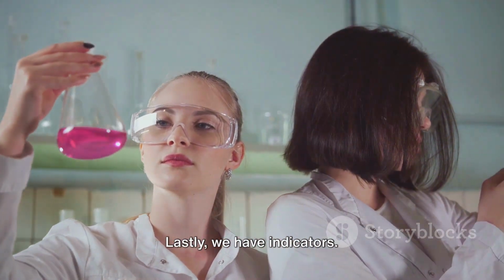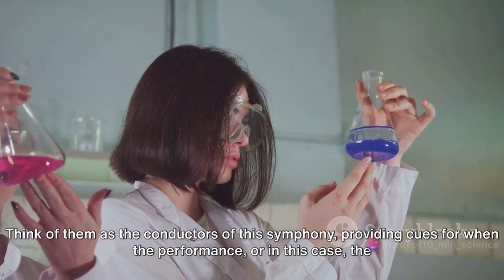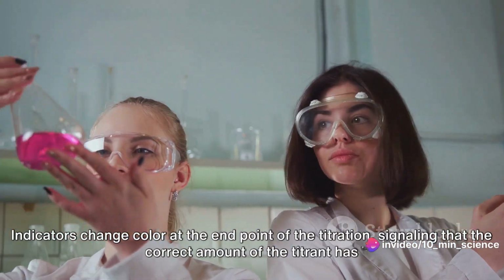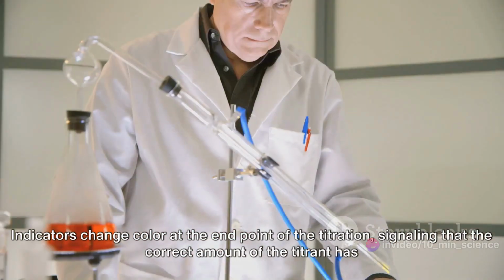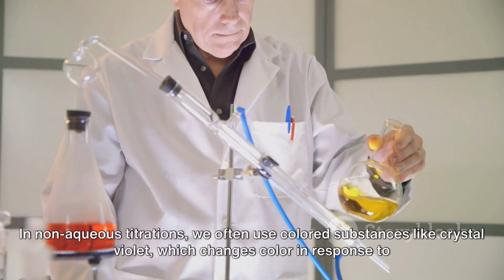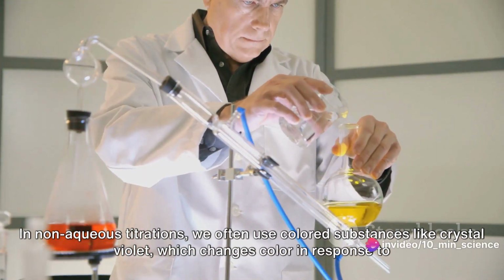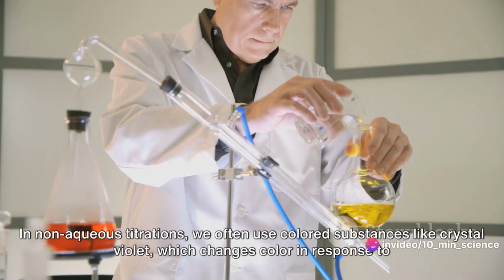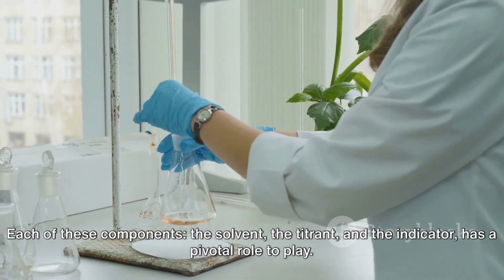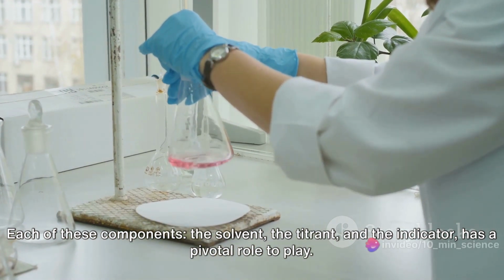Lastly, we have indicators. Think of them as the conductors of this symphony, providing cues for when the performance, or in this case, the titration, is complete. Indicators change color at the end point of the titration, signaling that the correct amount of the titrant has been added. In non-aqueous titrations, we often use colored substances like crystal violet, which changes color in response to changes in pH.